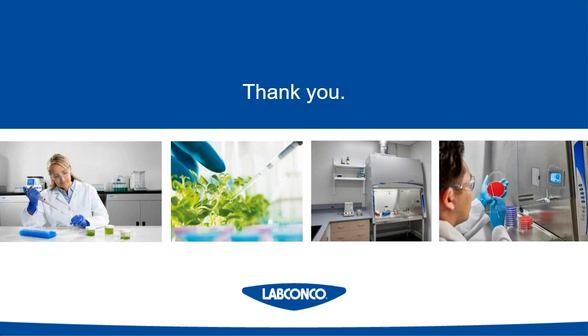Wonderful, thank you. All right, our next question here, how do I know what BSC is best for my specific biohazard? That's another really good question, and one that we get quite often. And basically, when it comes down to working with biohazards, all types of biosafety cabinets are equally safe.